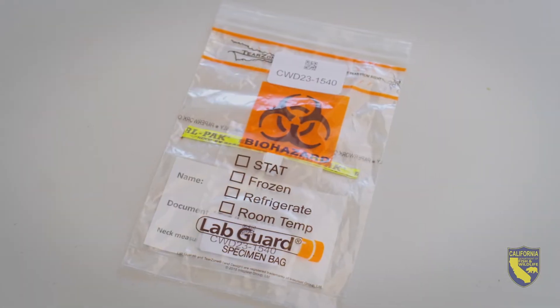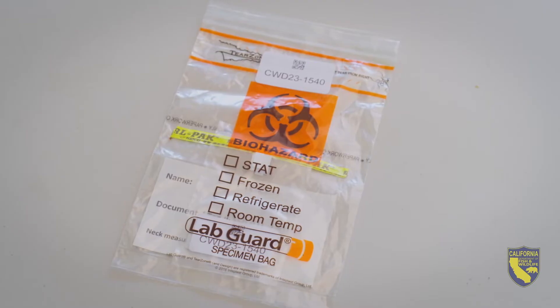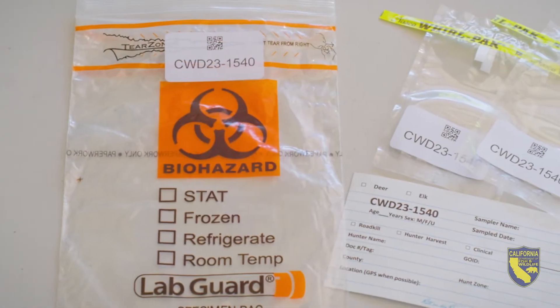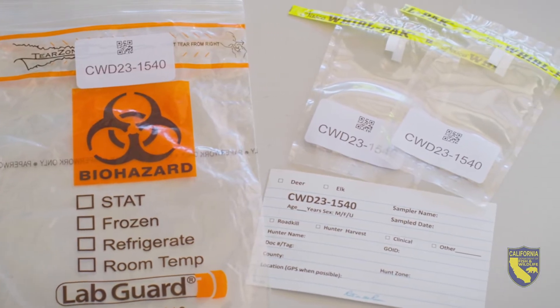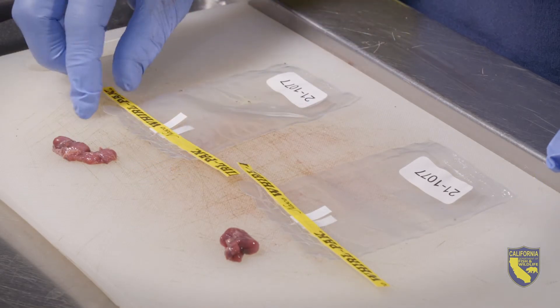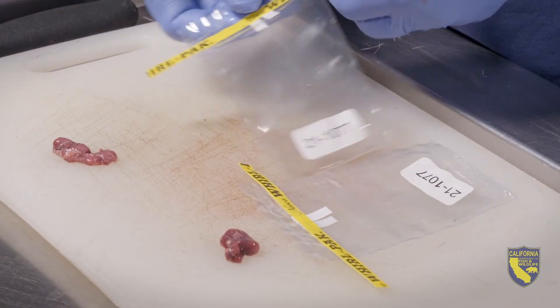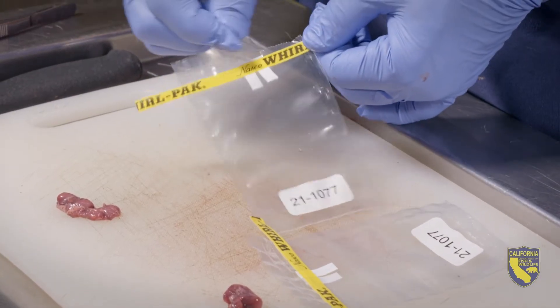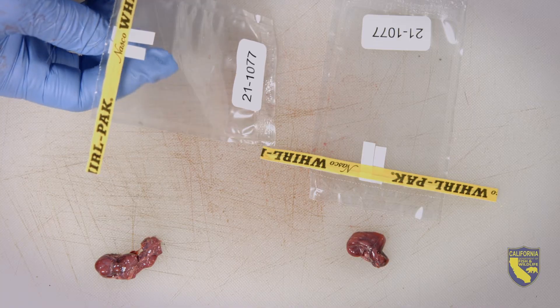The California Department of Fish and Wildlife specimen kit will look something like this. You'll have a larger resealable specimen bag, and inside you should have two sample bags and a data card. As cleanly as possible, prepare the specimen bags. Tear off the top part of the bag above the yellow tabs along the perforated line, and use the white tabs to open the bag.